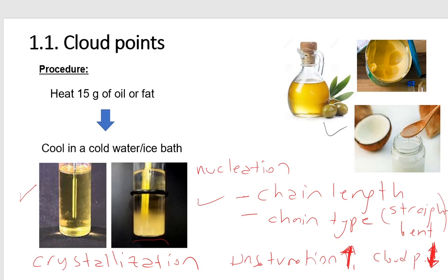So in your lab report, discuss these points and mention what the major triacylglycerols found in those lipid samples are. You can search in Google and relate your discussion to that triacylglycerol composition. What are the chain lengths? What are the names? Does the majority of those triacylglycerols have saturated or unsaturated fatty acids? Something like that. So briefly discuss them in your lab report.